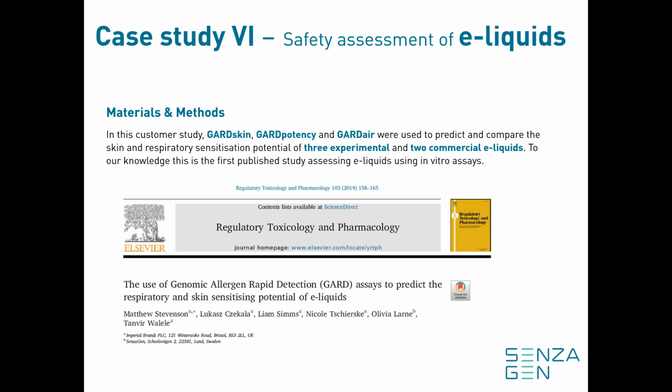As far as I know, this is the first published study. This is a collaboration that was performed together with Imperial Tobacco, and it has now been published. It is the first study that demonstrates the safety profile of e-liquids for the endpoint of skin and respiratory sensitization using only in vitro assays.